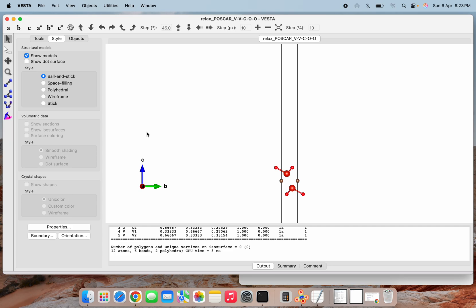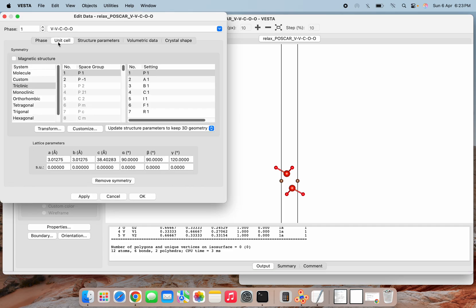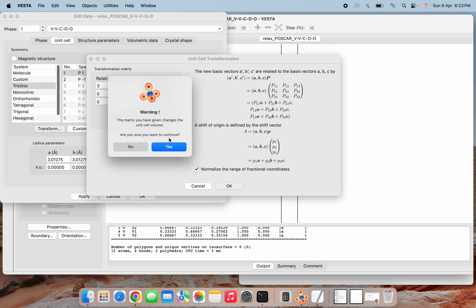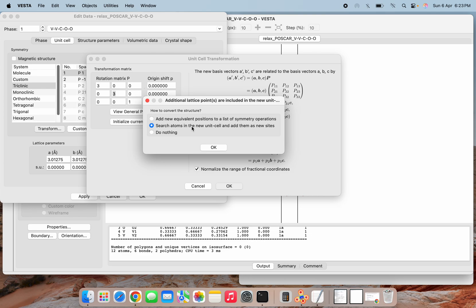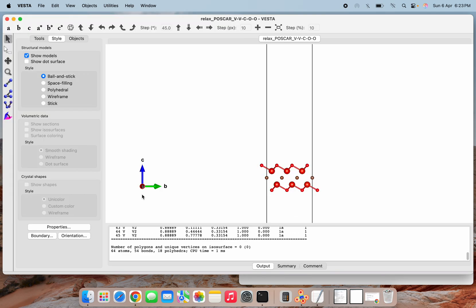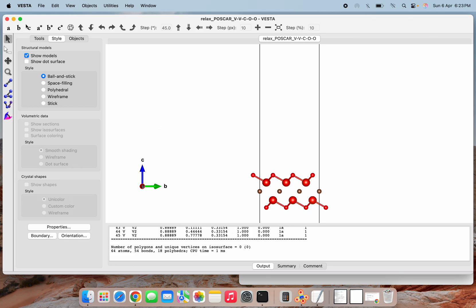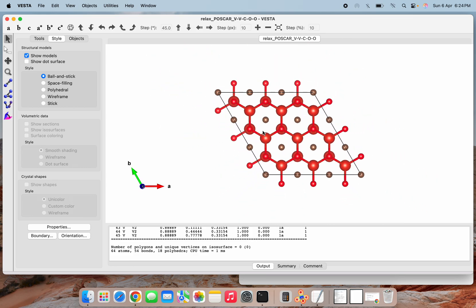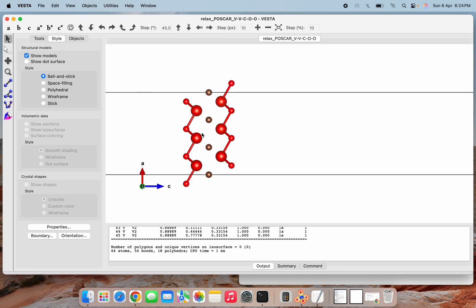If you want to make the slab, go to Unit Cell and do the transformation. Here I am doing 3-3-1. Search atoms, apply. This way you can see the slab. This is the V2CO2 slab — this is b and this is c — and these are oxygen terminations on both sides.